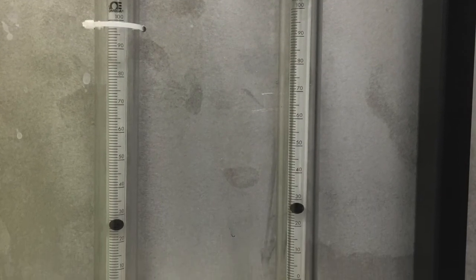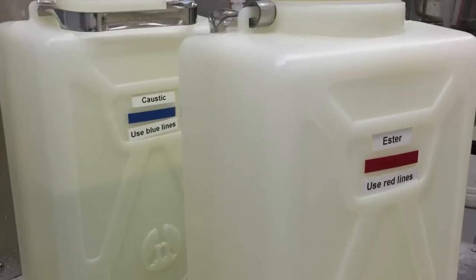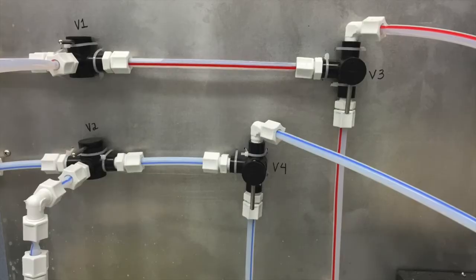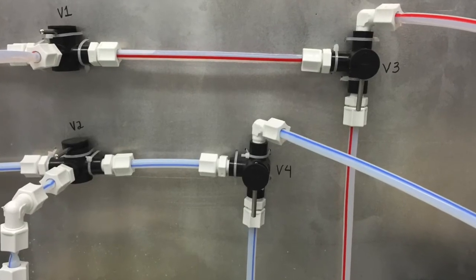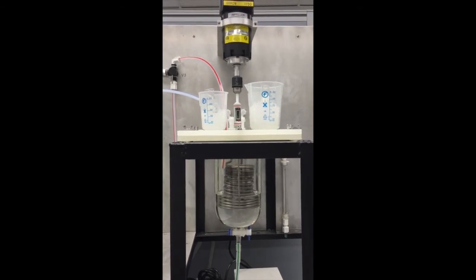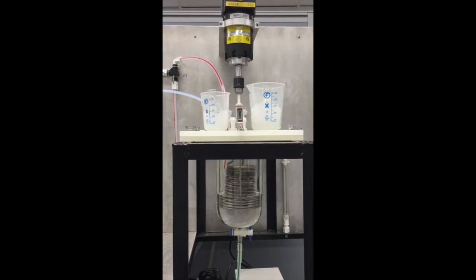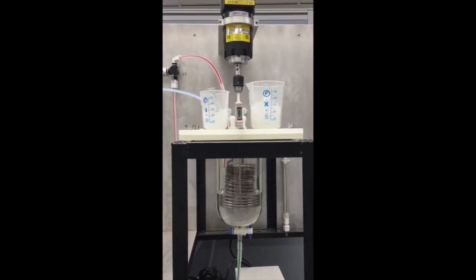Experiment. There are two parts to this experiment: batch reactor and CSTR. In the first part of the experiment, the kinetics such as the rate constant and activation energy of the reaction will be determined. Initially prepare and label the following reagents: 1 liter of 0.1 molar sodium hydroxide, 0.1 molar hydrochloric acid, and 0.1 molar isopropyl acetate solutions in volumetric flasks.